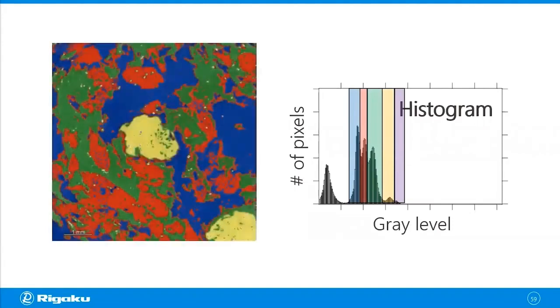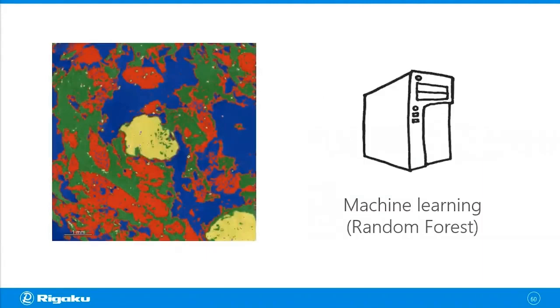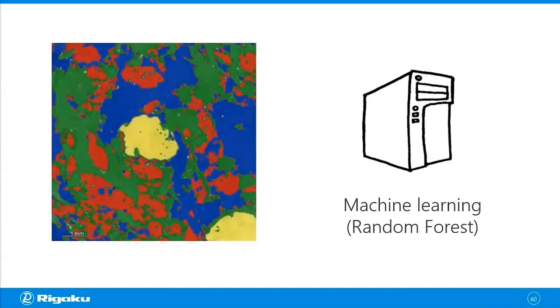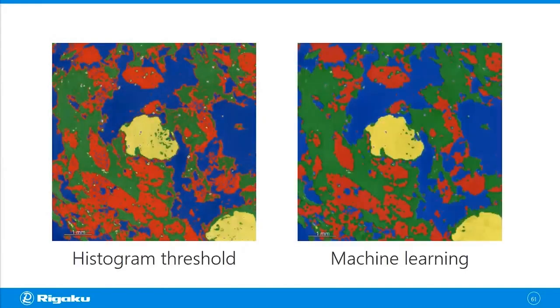But what if we use machine learning, random forest, for example, to tackle the same task? Then you're going to get a result that looks like this. So this is a lot cleaner segmentation. Let's compare them side by side.